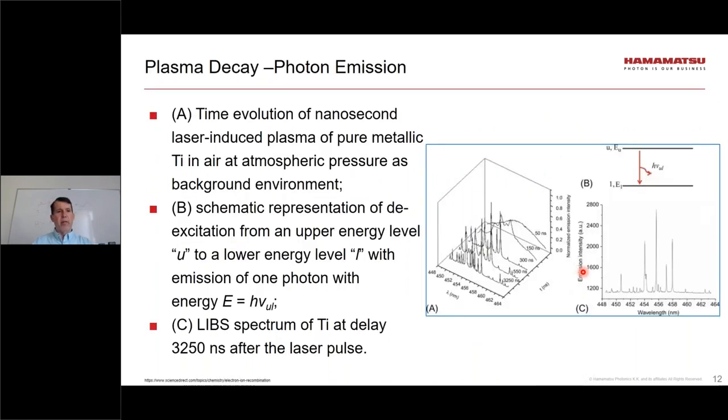We looked at the formation of the plasma. I've talked a lot about these excited states, and I think that this series of illustrations really helps to visualize what's occurring. So the spectral plot here is a time-wavelength plot. The gating of the detector, as I mentioned earlier, as the plasma is cooling, we want to be able to select a particular time window in the plasma in order to gain the proper spectral information.